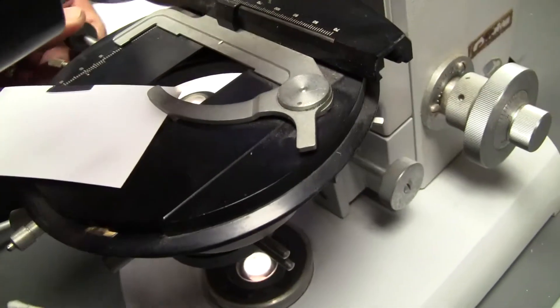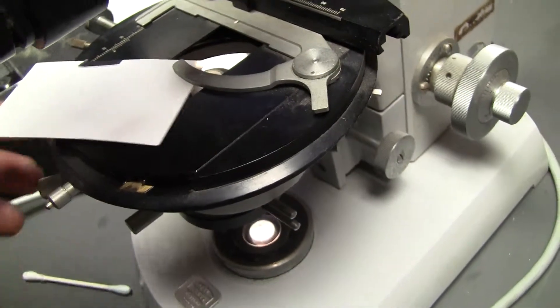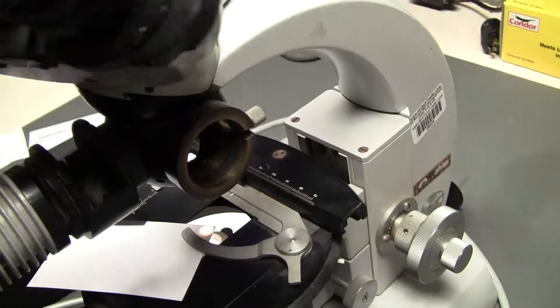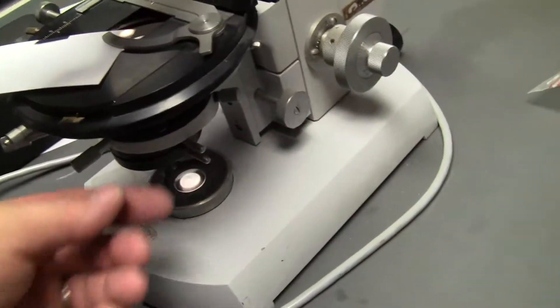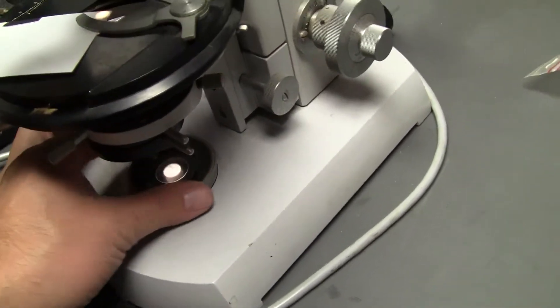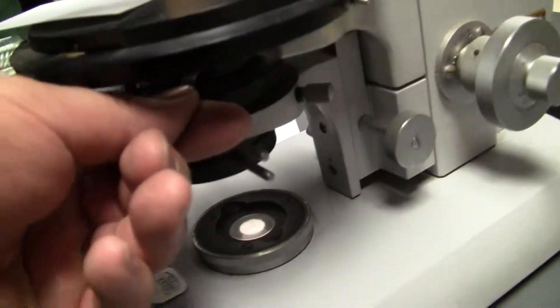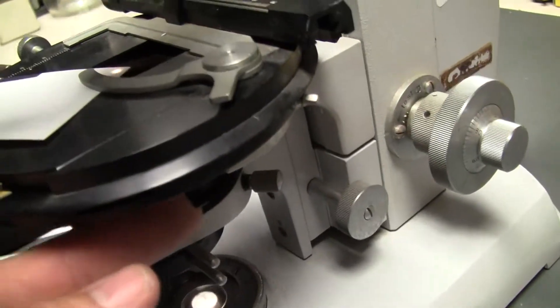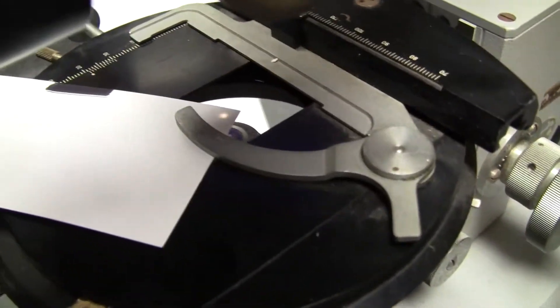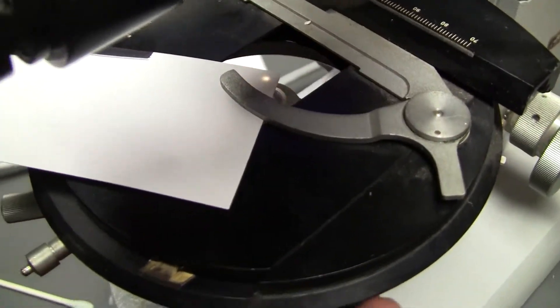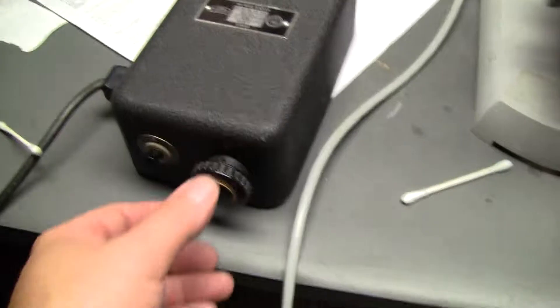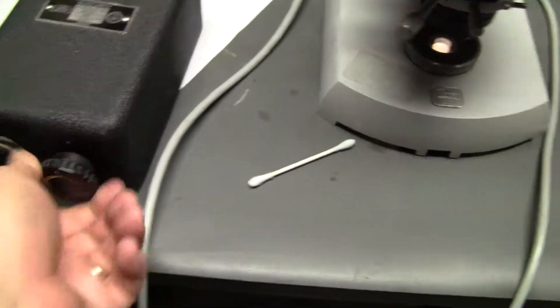The stage moves backwards and forwards. The head also swivels. You have some ways to adjust the amount of light. You also have a little filter switch down here, and you can adjust the light by tuning it down on the power supply.